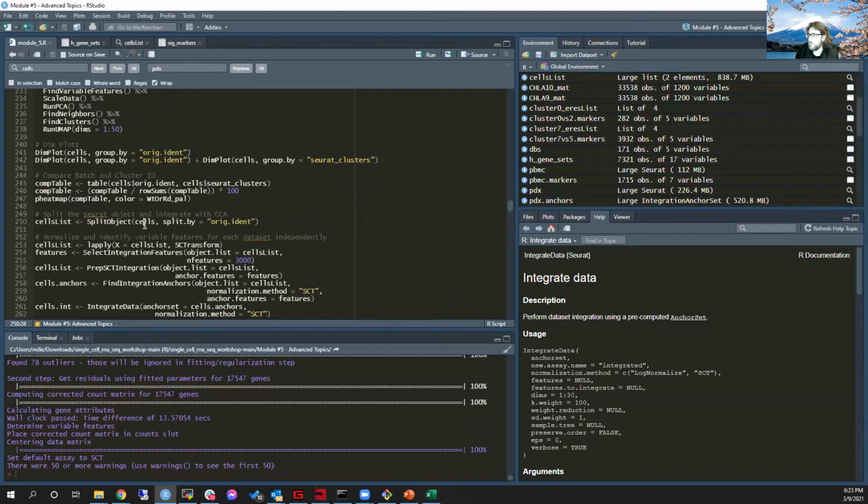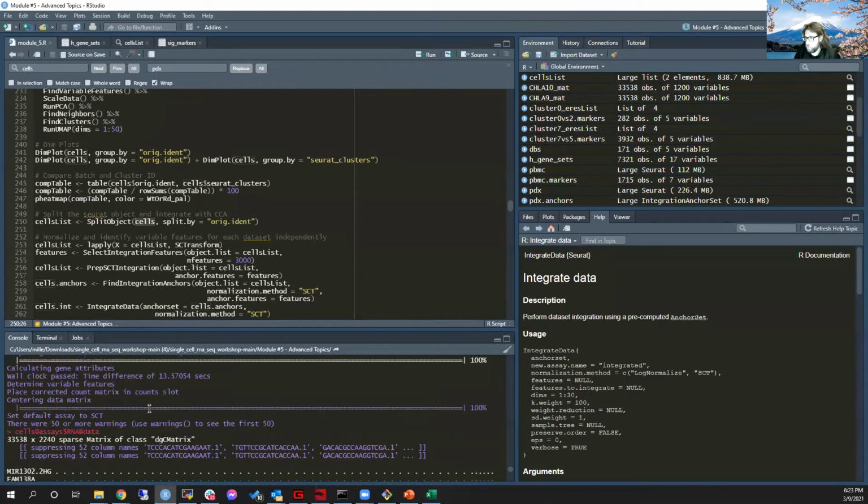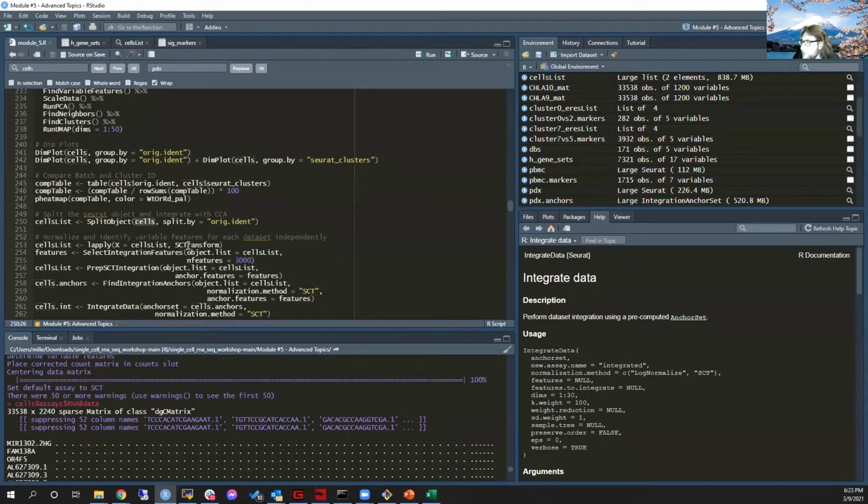So it's already there at this point. Okay. All right. So I see what happened here. So by the time you get to here, it is already cut down to 16,000 something.